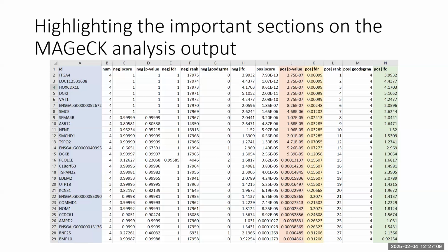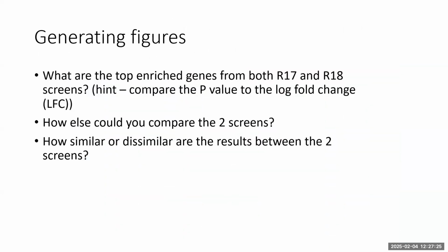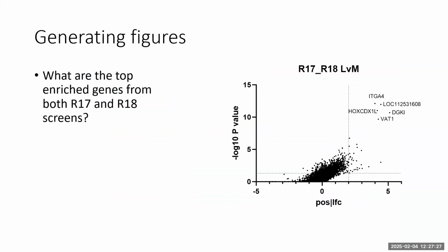And then this is basically the data set that you then work from to do all your visualization of the score. And as I said, I'm not going to go into that too much because you can map this out the way you want. A lot of the time, as I showed in the talk, we tend to do volcano plots. This is just one done with Excel, so it only has it in one direction. I think you need to use GraphPad to do the 2-directional volcano plots.